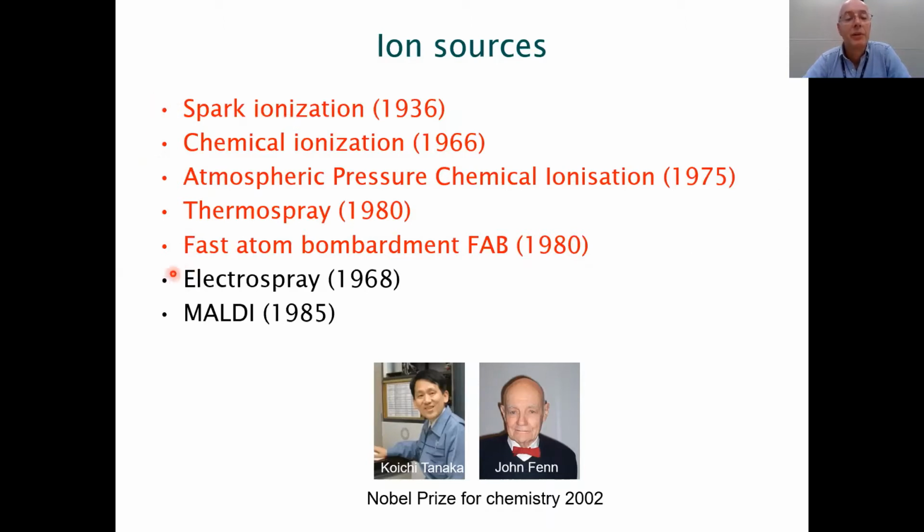However, these 2 ionization techniques, electrospray and MALDI, these are soft ionization methods. And the invention of these 2 techniques was responsible for a huge transformation in mass spectrometry and a huge explosion in the use of mass spectrometry for use in biology.